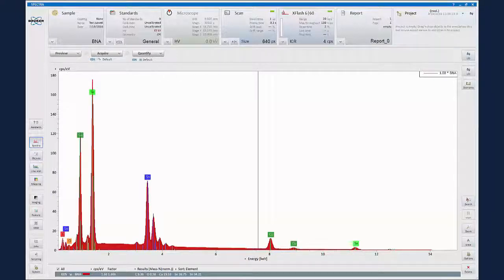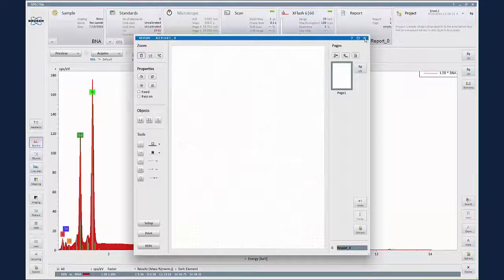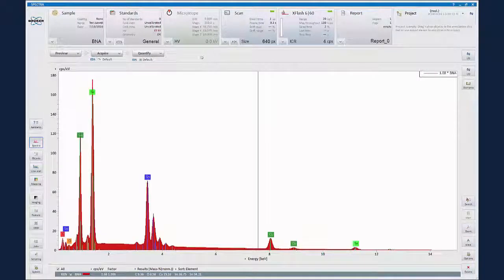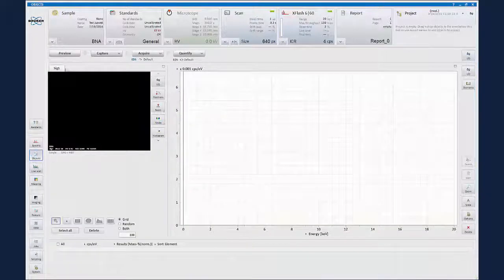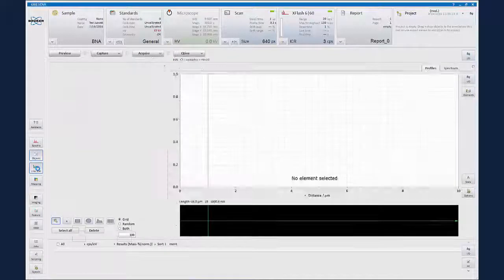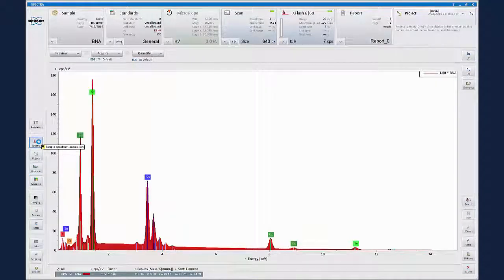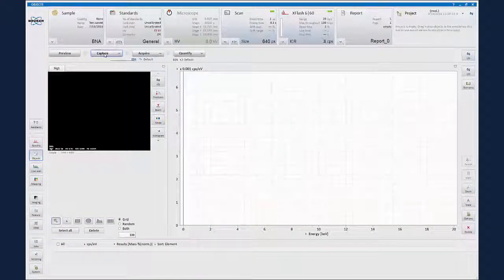Another important thing to note: as we select each object, we only go one level deep on all our menus. This makes the learning curve much, much quicker. Also, as you select your workspace operations, whether you're doing spectrum, object mode, collecting an image and doing spectral analysis, or doing a digital line scan, all your controls are located here, and they're very repetitive. So only the things that are unique for that analysis are up there, and any common controls remain the same.